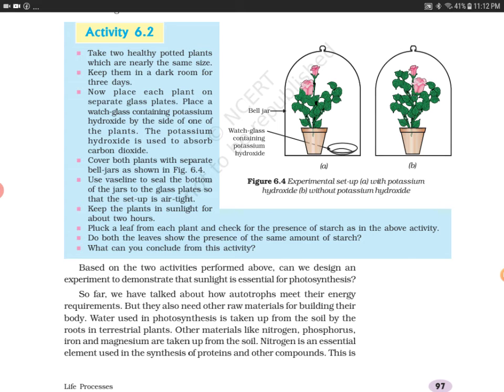Cover both plants with separate bell jars. Make the setup airtight so that there is no contact with air from outside. Use Vaseline to seal the bottom of the jar to the glass plate so that the setup is airtight. One jar contains potassium hydroxide and the other does not.